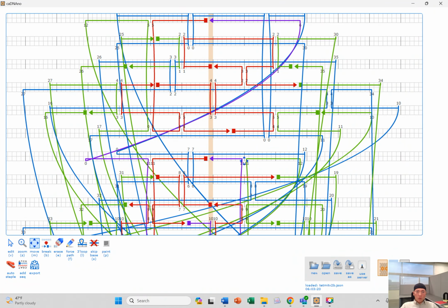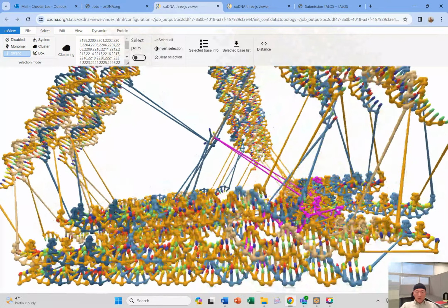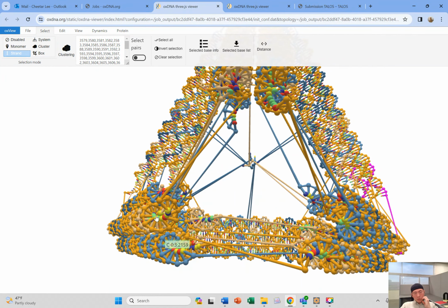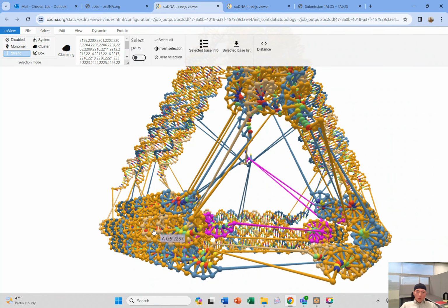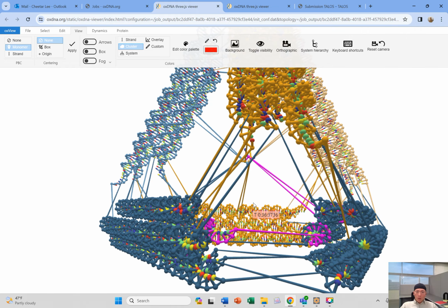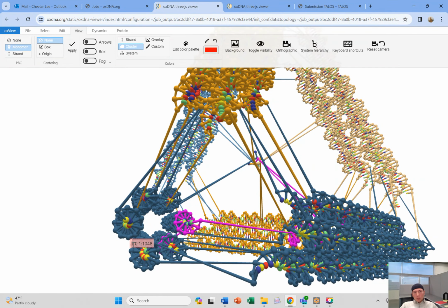So from going from one bundle to another bundle, you'll see how the bundles connect to one another is, if you look on its vertex, you'll see that the two exterior bundles will connect to the other two exterior bundles that are closest to it. So this, let's go ahead and view clusters. All right, so now we have this cluster, this cluster, this cluster, this cluster, this cluster, or edge we can call them, or bundle we can call them. But all I'm saying is the exterior bundles connect to the exterior bundles. The side bundles, or the side helices, connect.